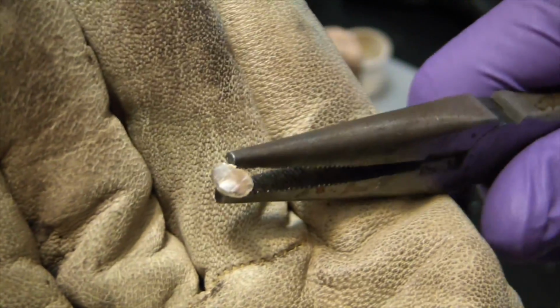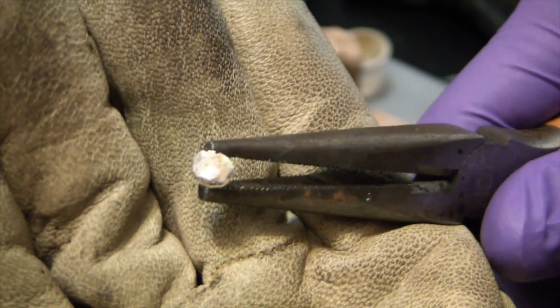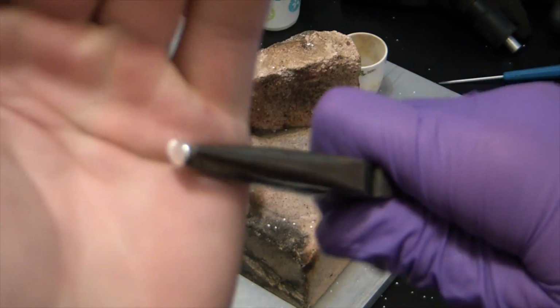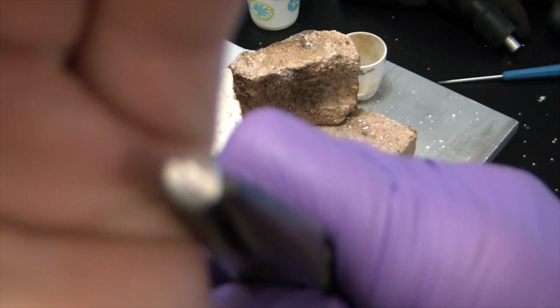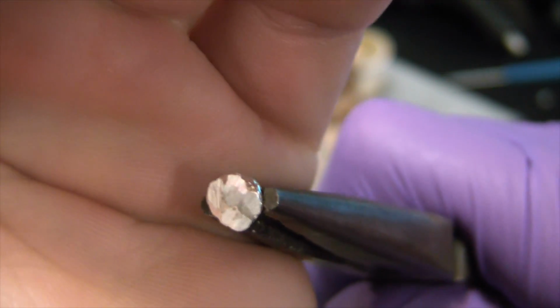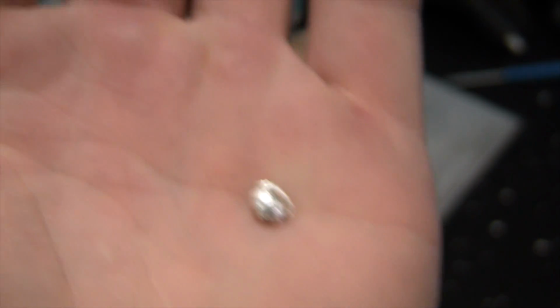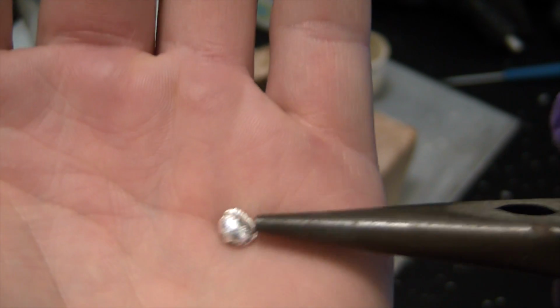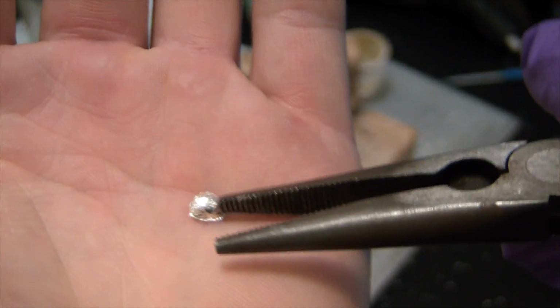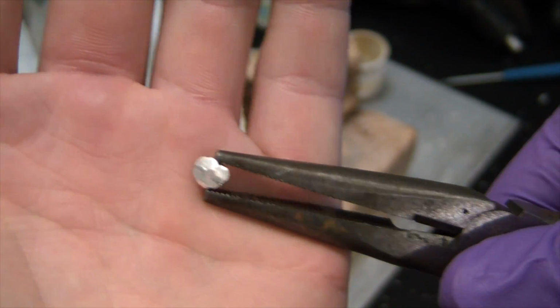So I'm just going to hit that on the bench grinder real quick, get that ceramic out of there. Hopefully not introduce any metal impurities. Alright, just hit it on the bench grinder. Got rid of all the ceramic residue. And nice pure silver bead. At least, hopefully, very pure silver bead. Now we're going to dissolve this back in nitric acid to make a pure solution of silver nitrate.